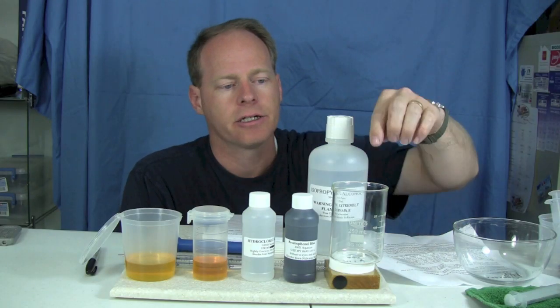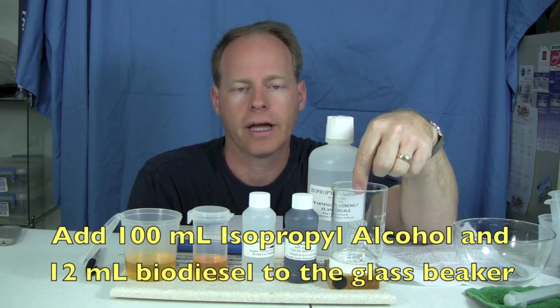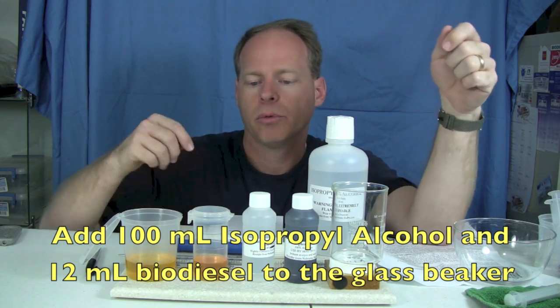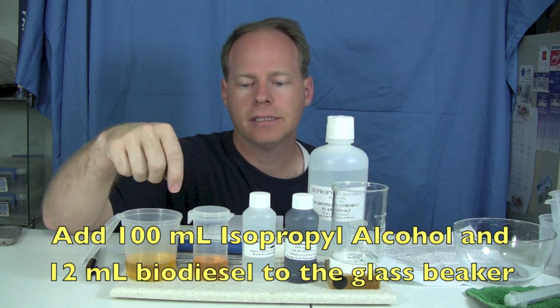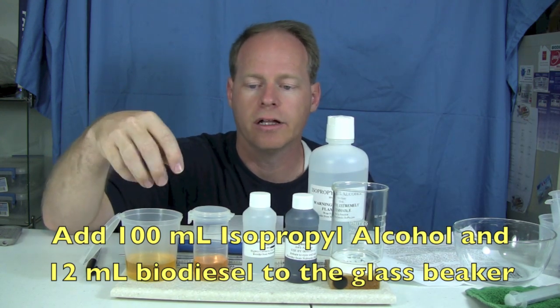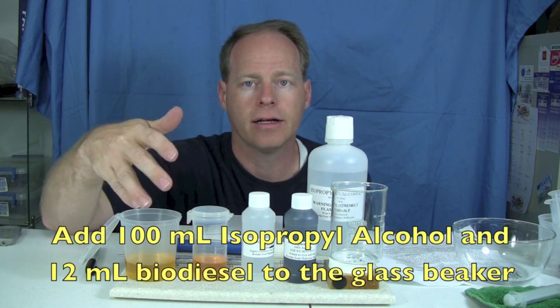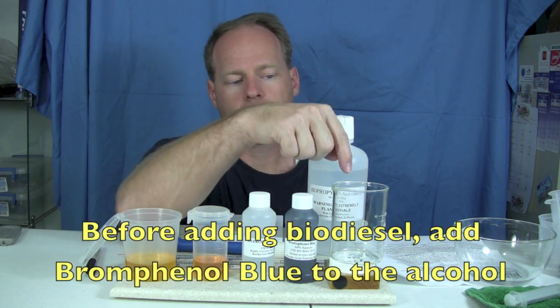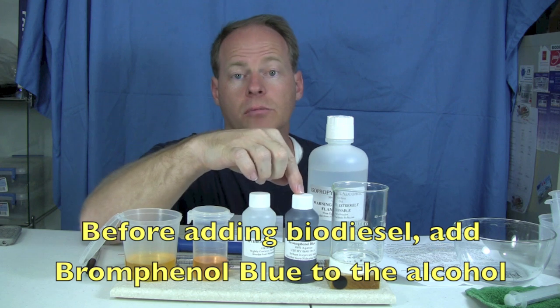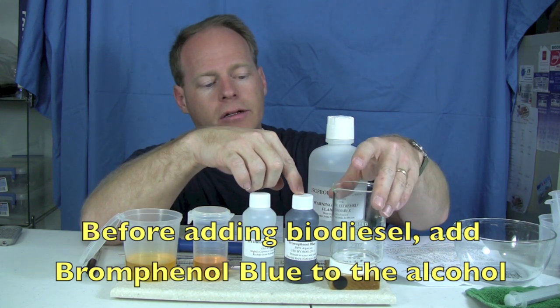To do this test you're going to measure 100 milliliters of isopropyl alcohol and put it right in your main jar. Then you're going to put 12 milliliters of biodiesel in here. There's been some discrepancies in the past — 10 or 12 — but the basic theory is that you use 10 grams of biodiesel, and 10 grams is roughly 12 milliliters. So we'll use 12 milliliters.